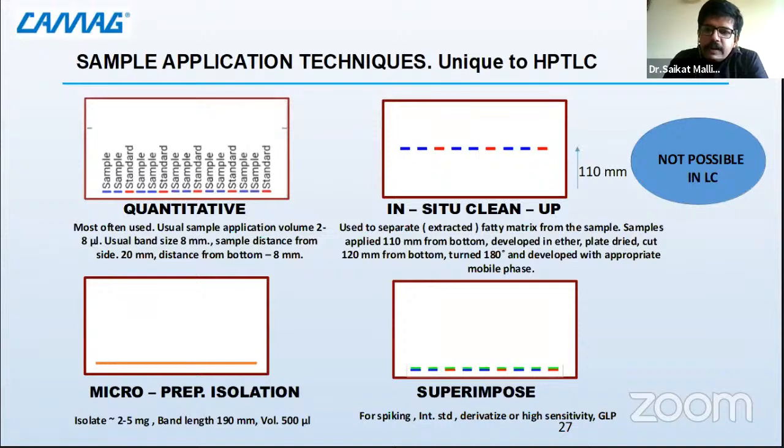Like, you have a fatty oil sample, you generally massage with oils on your leg or your hair. You get some very Navratna tail, you use it, you are very happy with it. So these are medicated oils, and if you want to analyze the medicated part, it is very difficult to remove the medicated part from the oil.